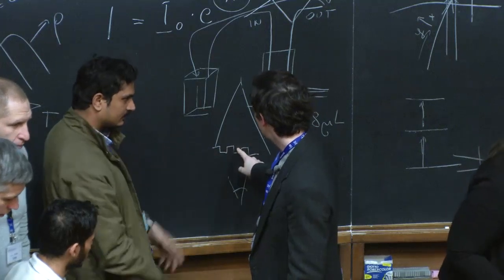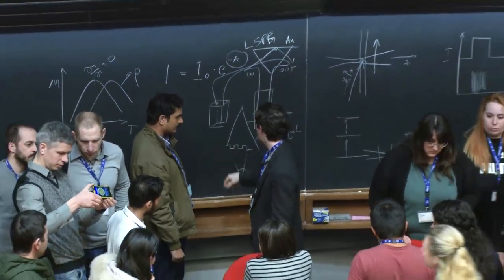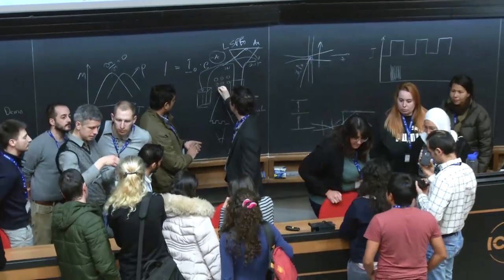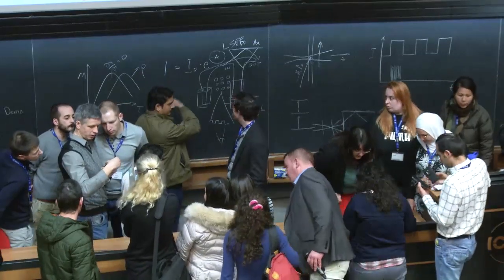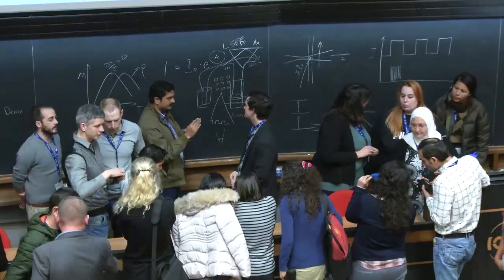The periodicity is 500 nanometers, and these are about 380 nanometers wide. It's a nano hole array. And the depth is about 300 nanometers. The pattern is like this, a dip, and with the change in refractive index, it shifts. It red shifts.